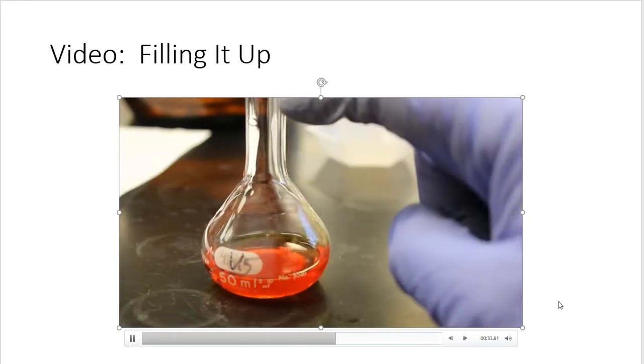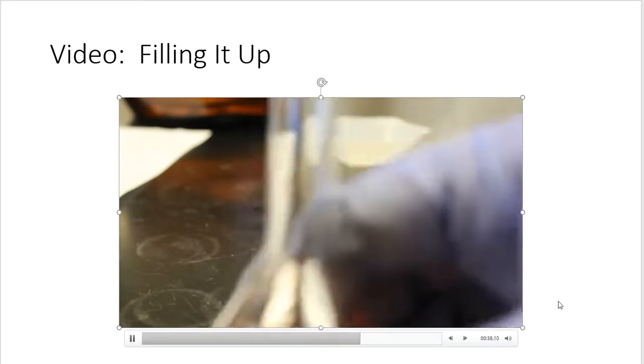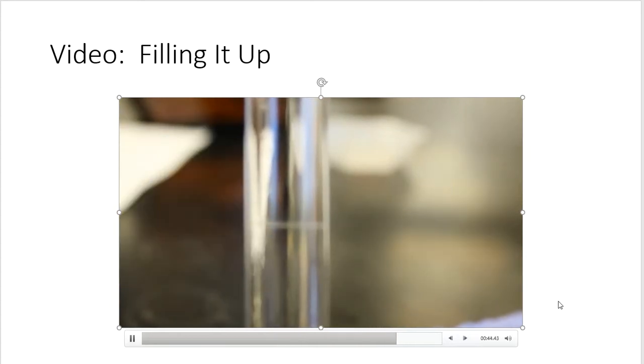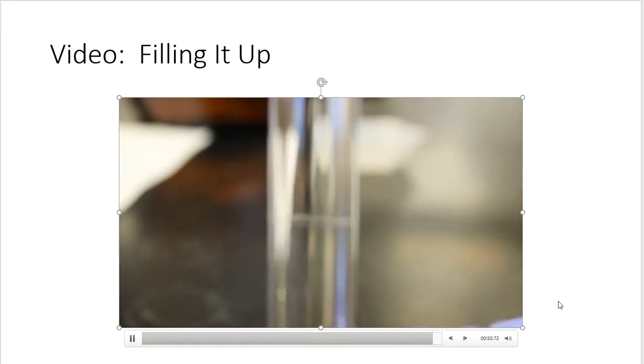The line for 50 milliliters is right here. I don't know if you can see that on the screen or not, but right there it is. And I'm going to make sure that I dissolve it fully before I go up to the line.